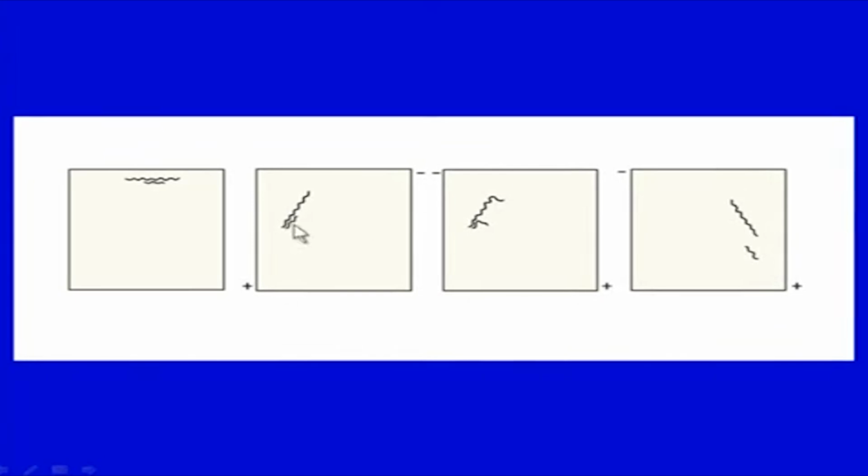This is how, as you shift the field from one direction to another, smaller ones reorient as well as move and migrate faster, and this is the basis of separation in pulsed field gel electrophoresis.